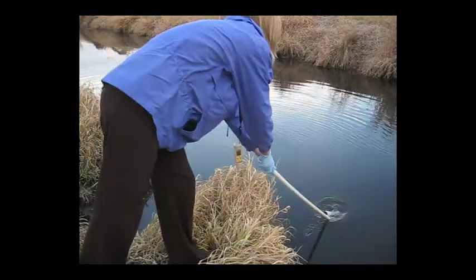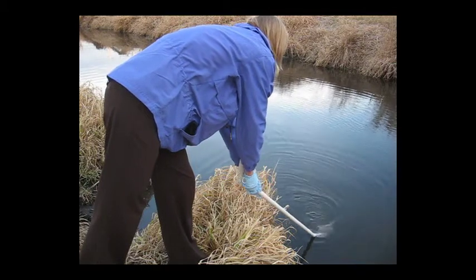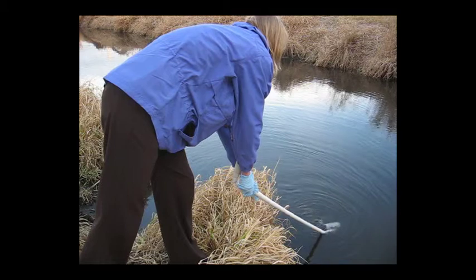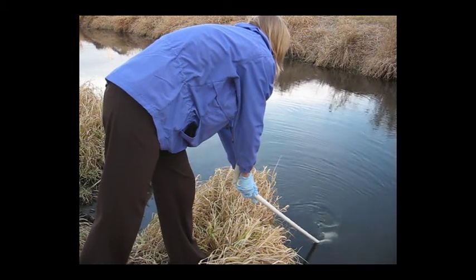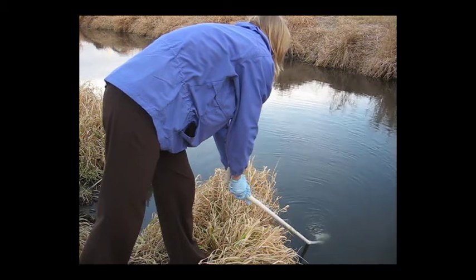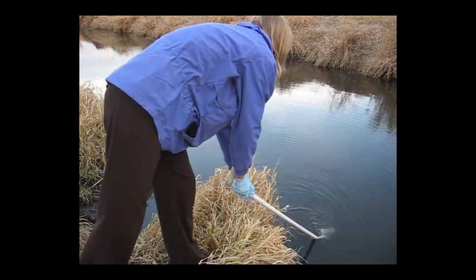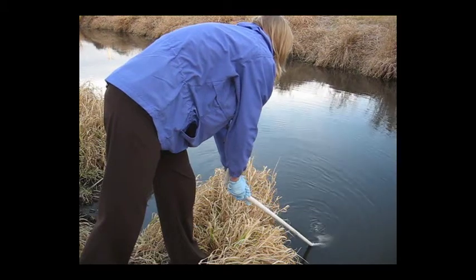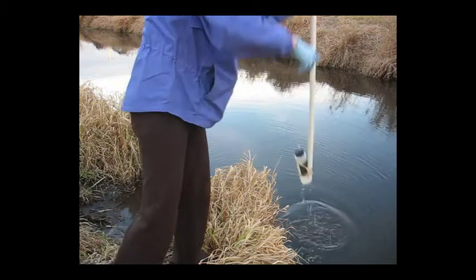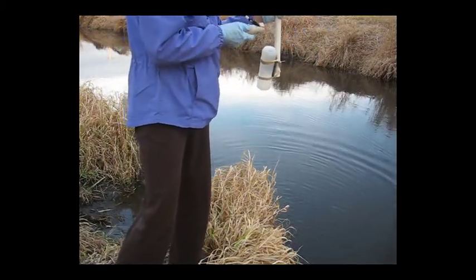To collect the sample, lower the rinsed sampling bottle slowly down to the water column, avoiding contact with the stream bed. Raise the bottle slowly back up through the water column, and repeat the raising and lowering process as needed until the bottle is filled. Inspect your collected sample for large particulates that may have been captured due to stream bed disturbance. If you see large particulates in your sample, discard it and resample.